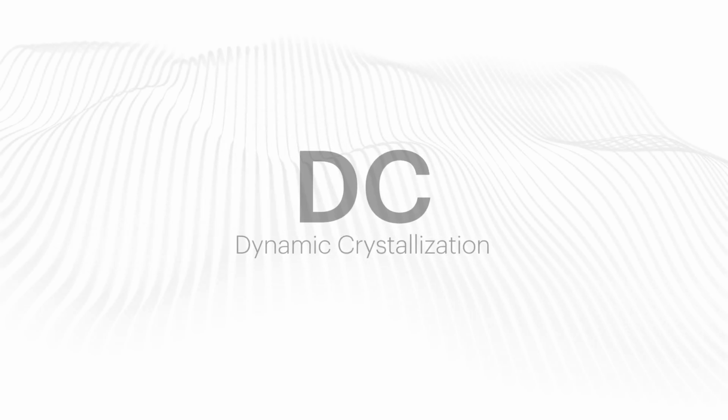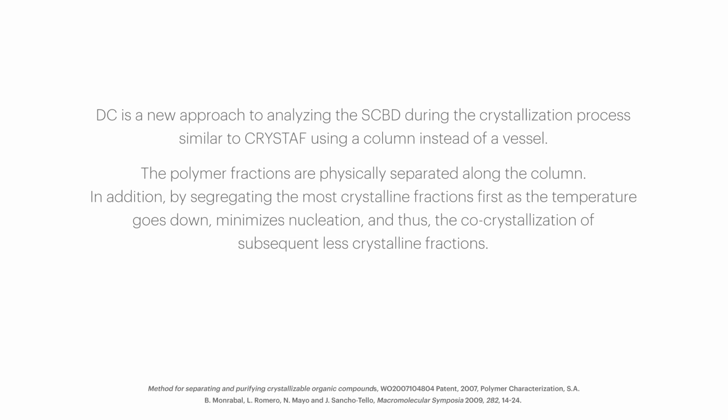DC, dynamic crystallization. DC is a new approach to analyzing the SCBD during the crystallization process, similar to CRYSTAF using a column instead of a vessel. The polymer fractions are physically separated along the column. In addition, by segregating the most crystalline fractions first as the temperature goes down, it minimizes nucleation, and thus the co-crystallization of subsequent less crystalline fractions.